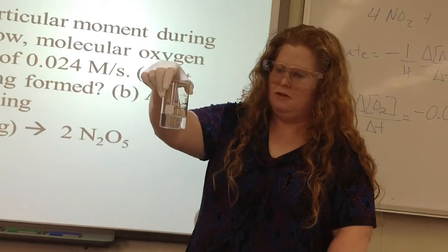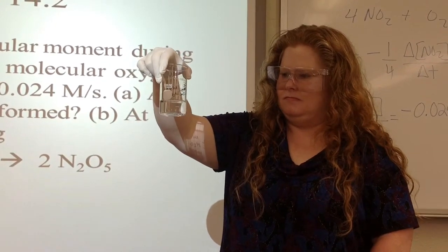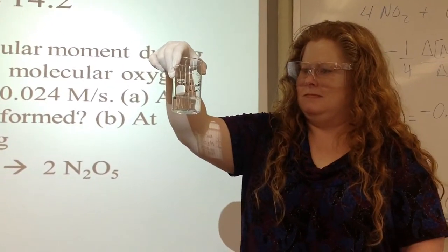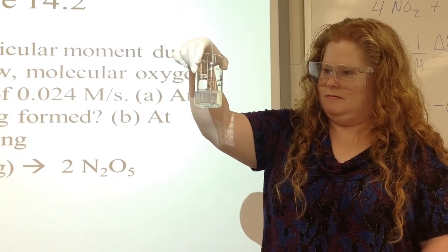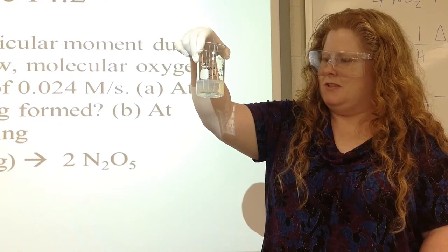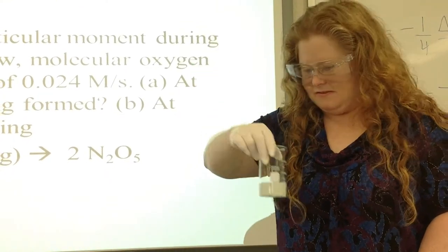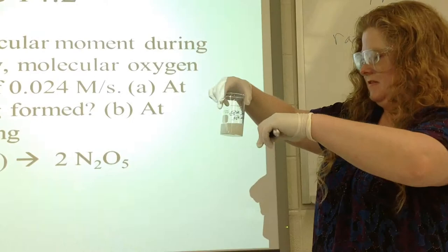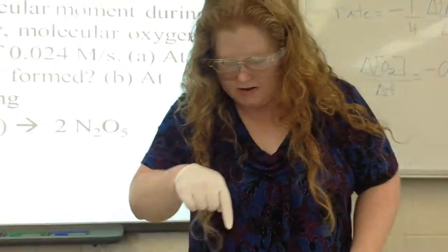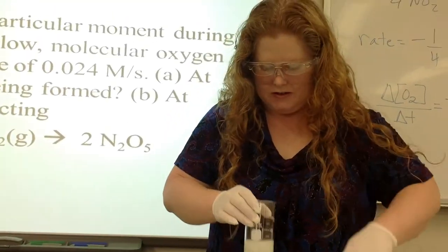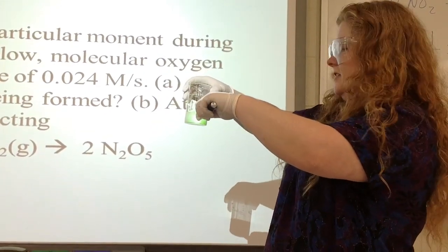All right. So, I'm just watching it here. Starting a little bit. How long? How much time are we at right now? Yes. We're already past the time. Well, I can still see the X. I can still see it. Okay. It's gone. So, if you look straight down, that's really what you have to do to see the X disappear. And, it stinks too. So, we can't see any light through it any longer.